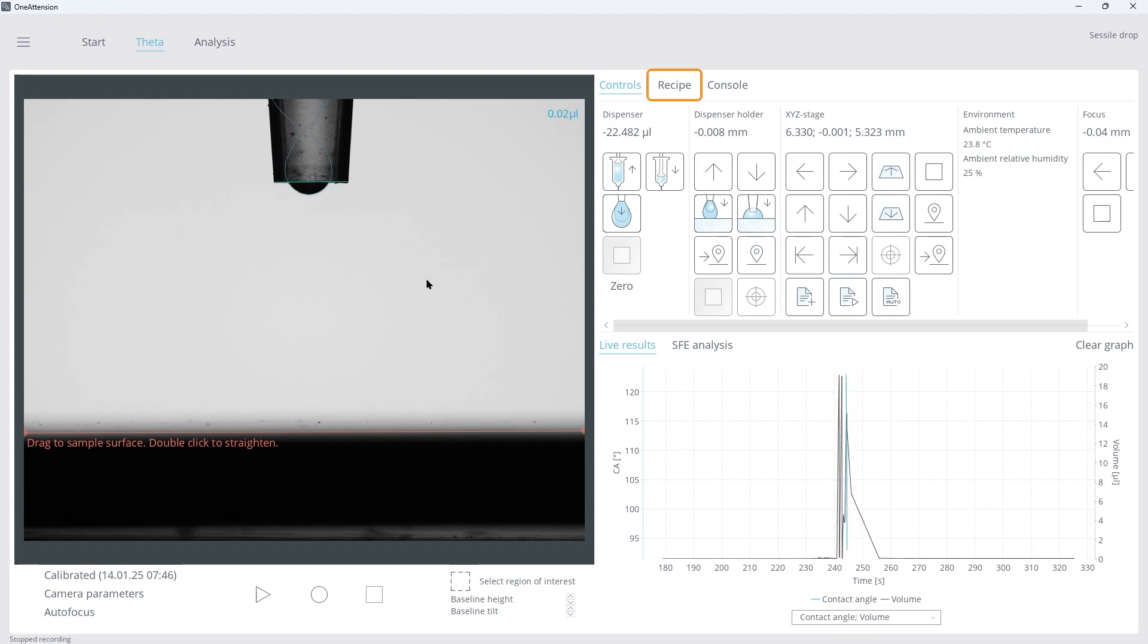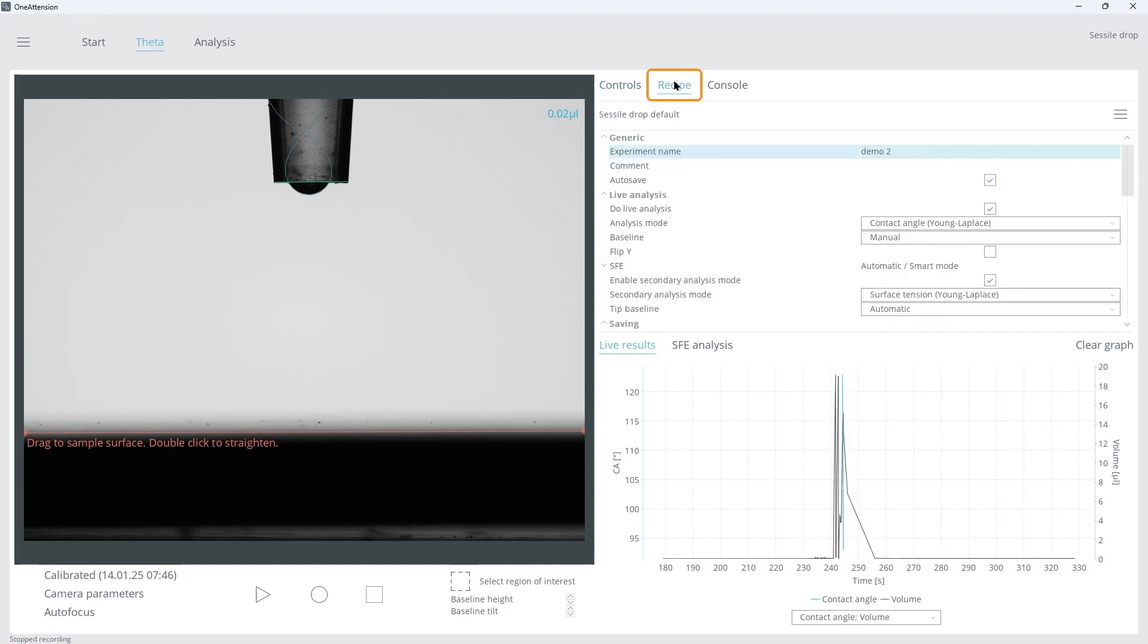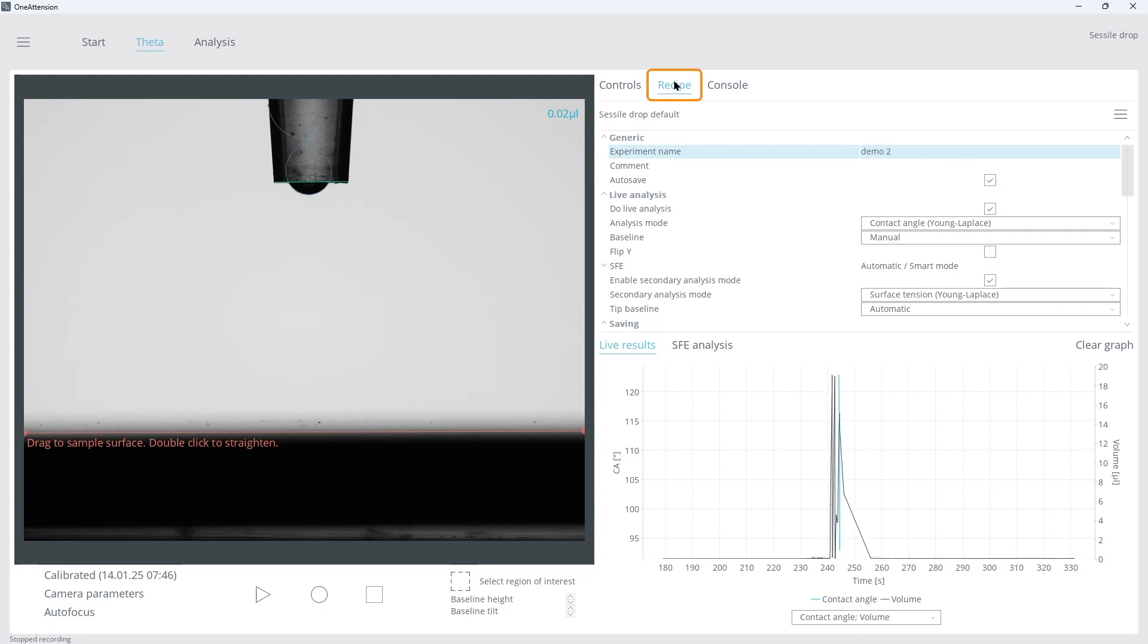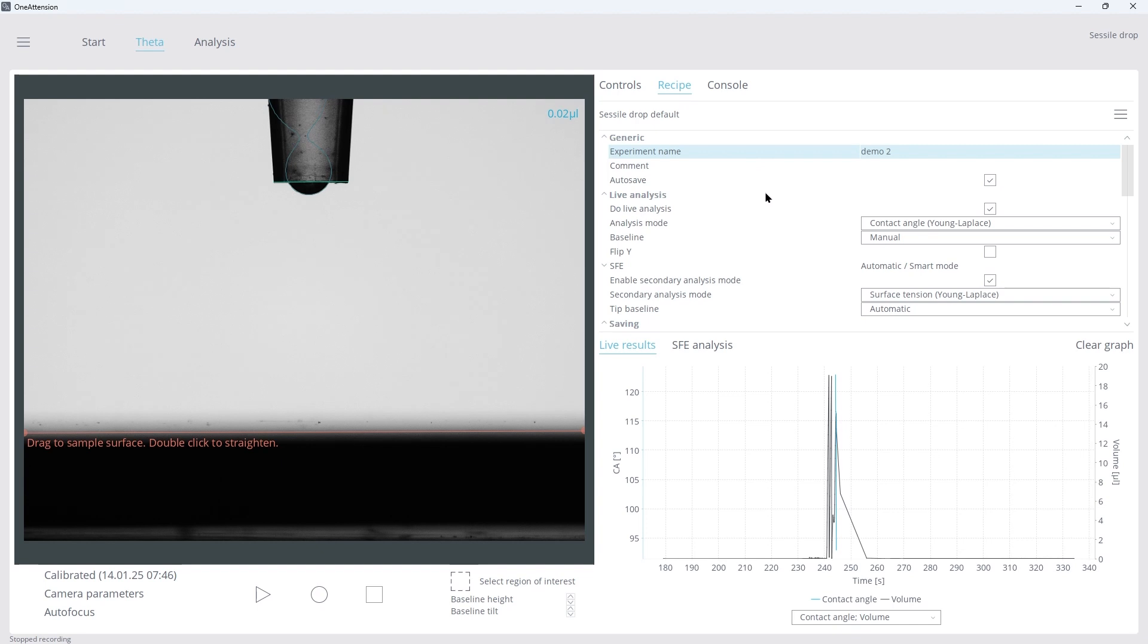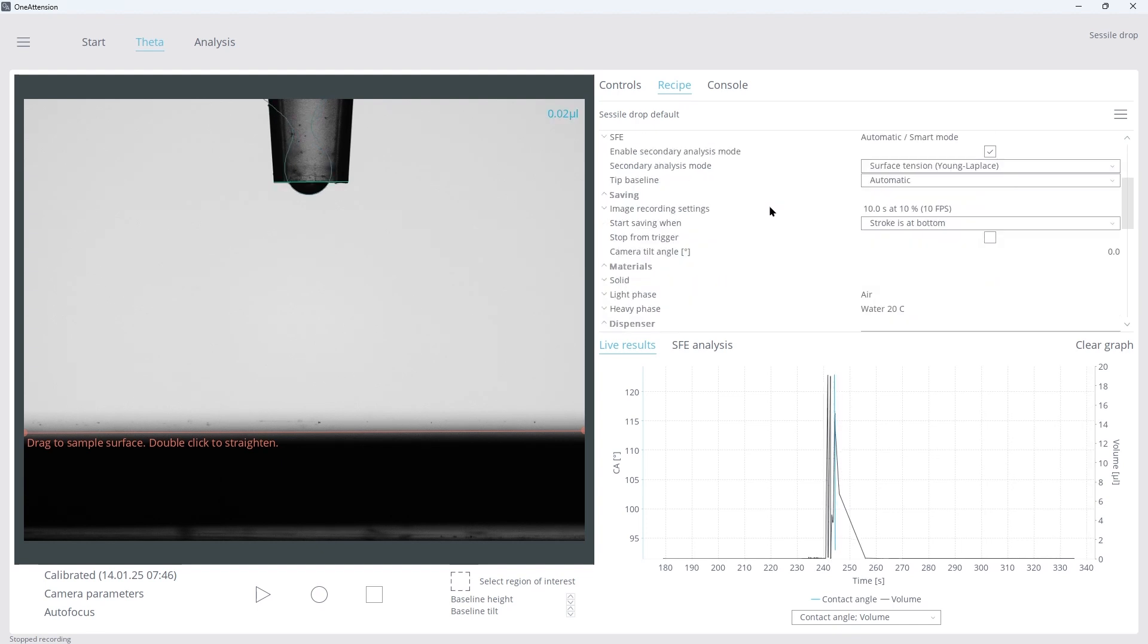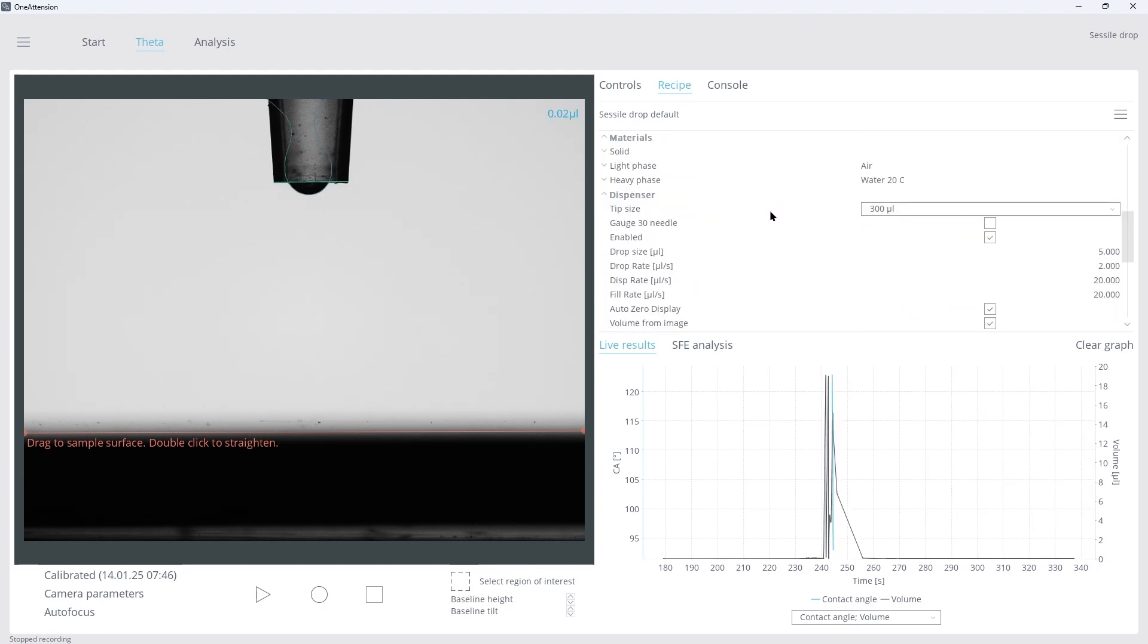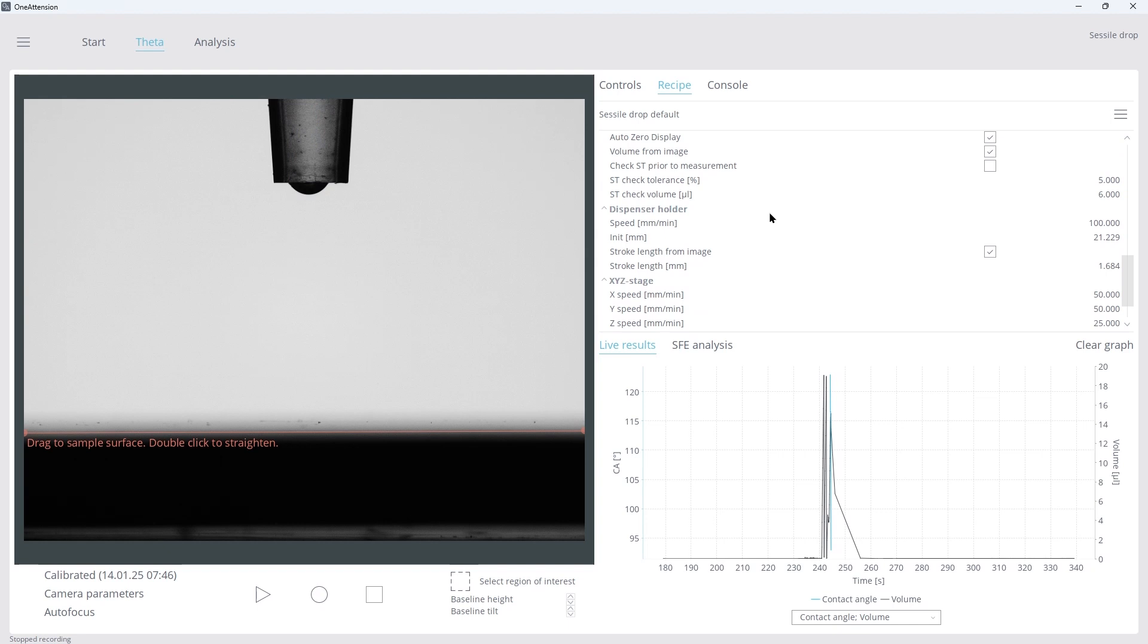The Recipe tab has everything we need to control our experimental parameters for the contact angle measurement. Here, we can change parameters such as droplet volume and measurement time, and also fine-tune the controls for stage and dispenser speeds.